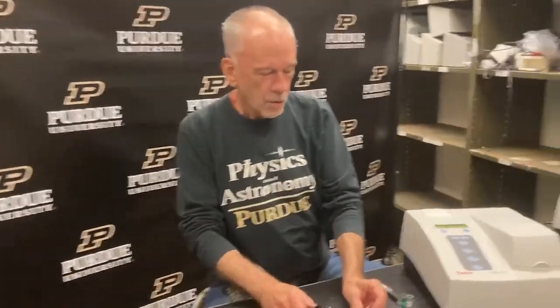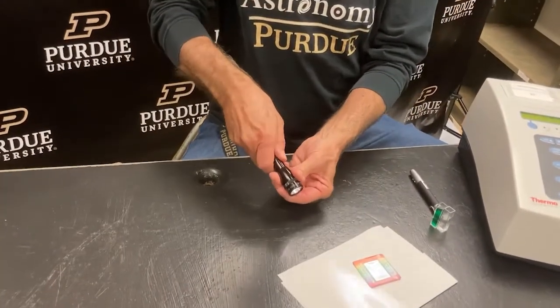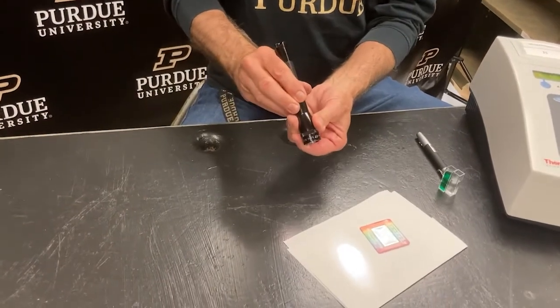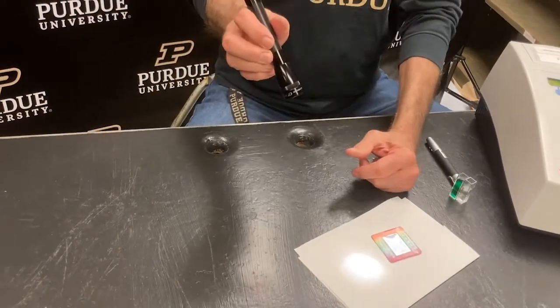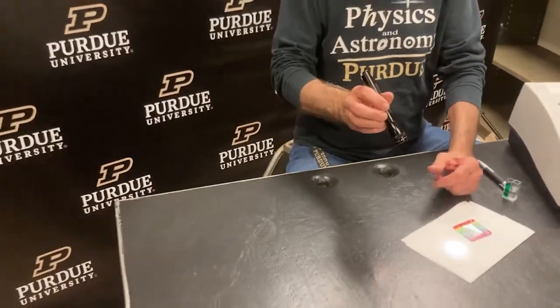So, Bill, I've got something I want to show here. If you can come a little closer. We have, if you have white light, for example, the light coming from a flashlight. And you know what, Bill? Should we dim the lights? Yeah, because I really can't see much. Okay, let's dim the lights.